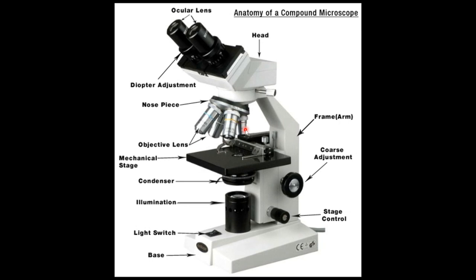At low power, there's just no other way to make it work. Once you get even reasonably proficient with a microscope, it'll be nothing. You'll start it, it'll be like instinct. You'll just start at low power, you're looking at it, boom. It'll only take you about 10 seconds to find your object and get it in focus.